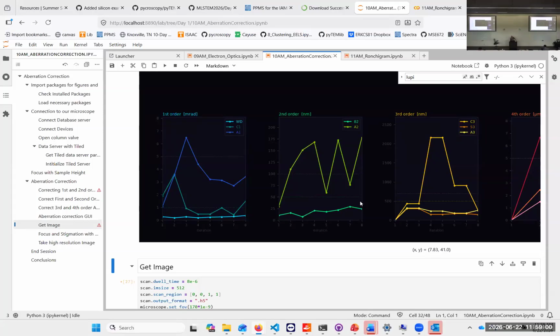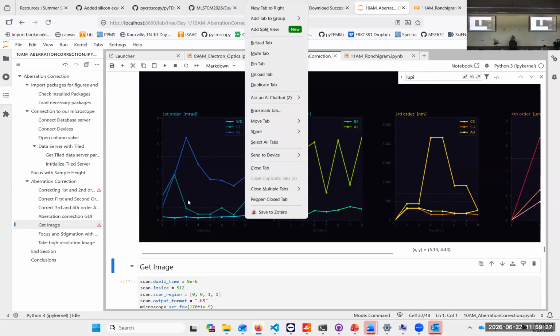Okay, so you can do it quite pragmatic. So I have the last one here. That was at 11. So that goes back to the question of how do you get the nanometer size quantification in the aberration coefficients with simulation. So we just did that, right? That's why I didn't answer it quite correctly in the beginning, but we just correlate that.